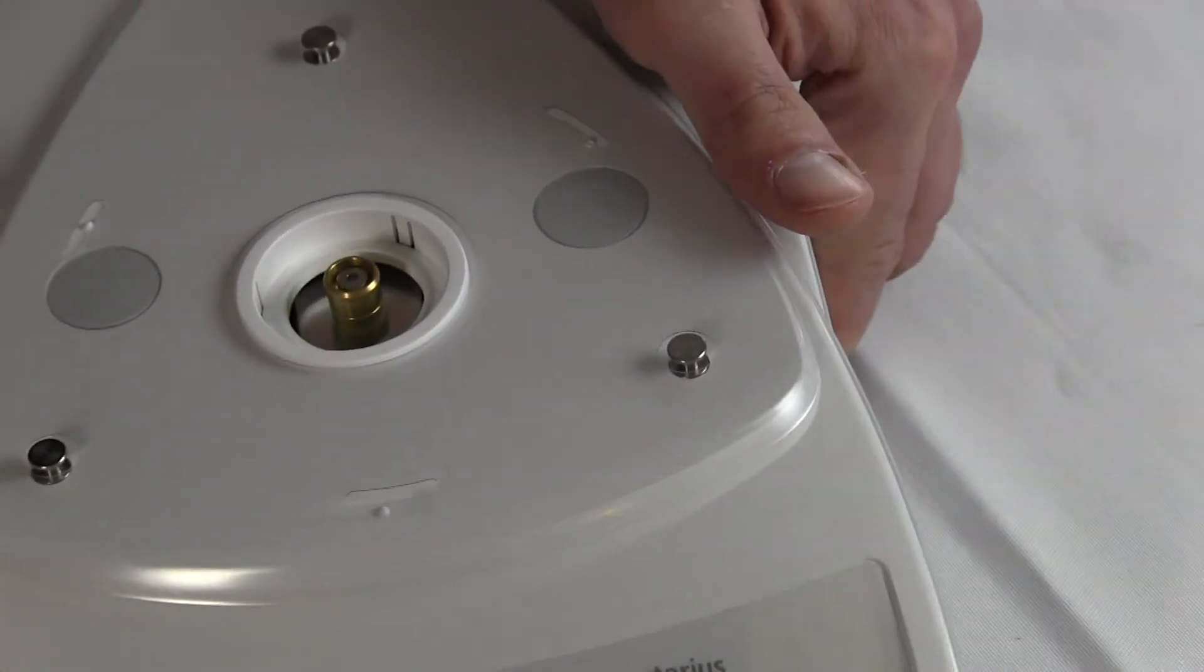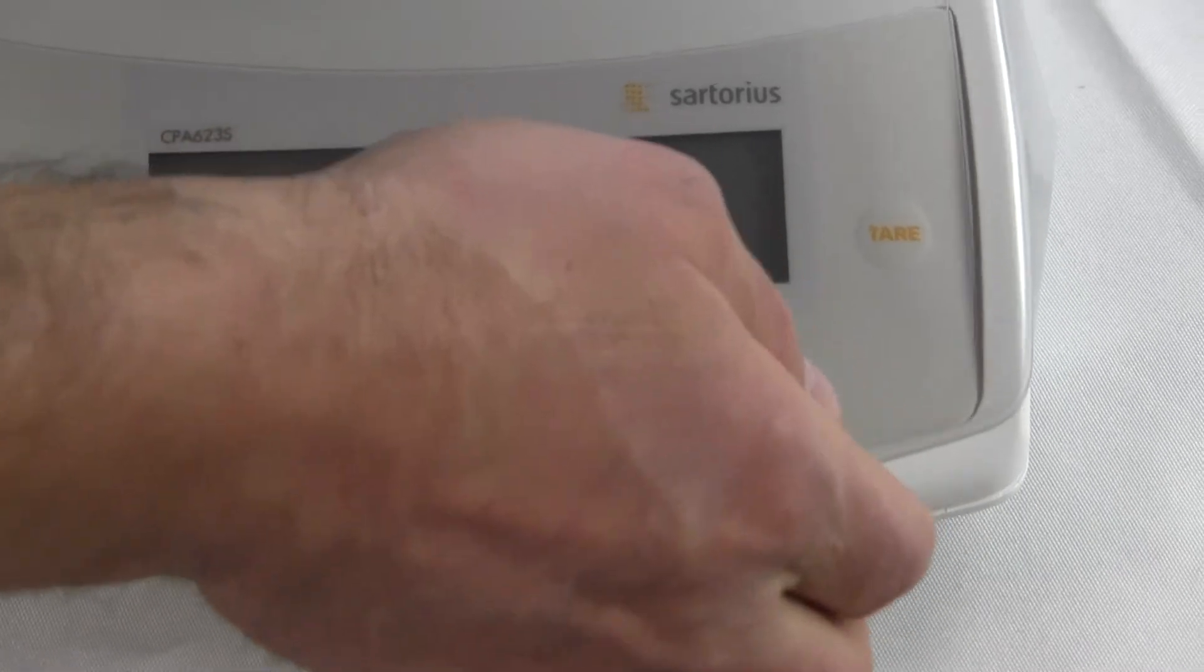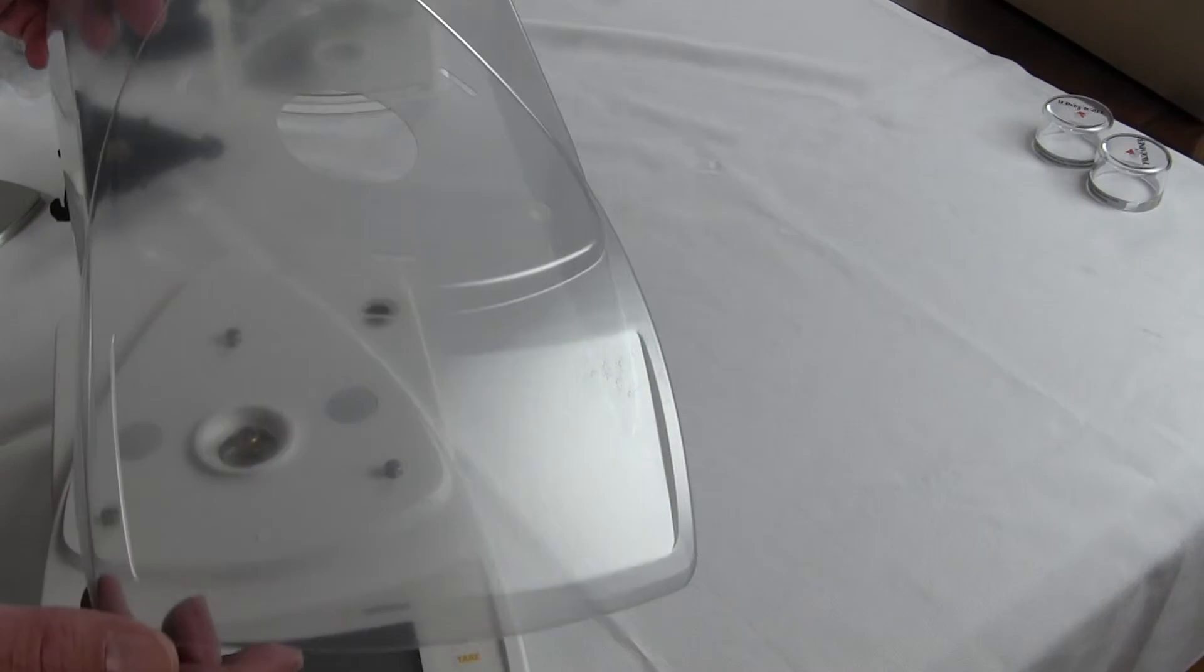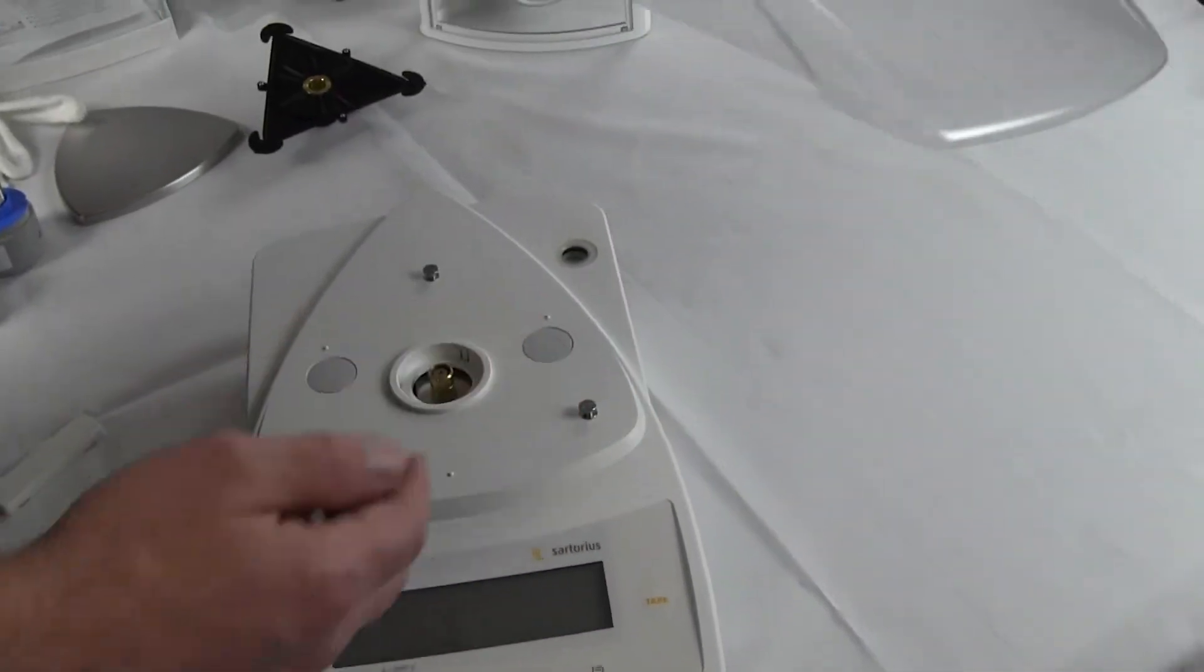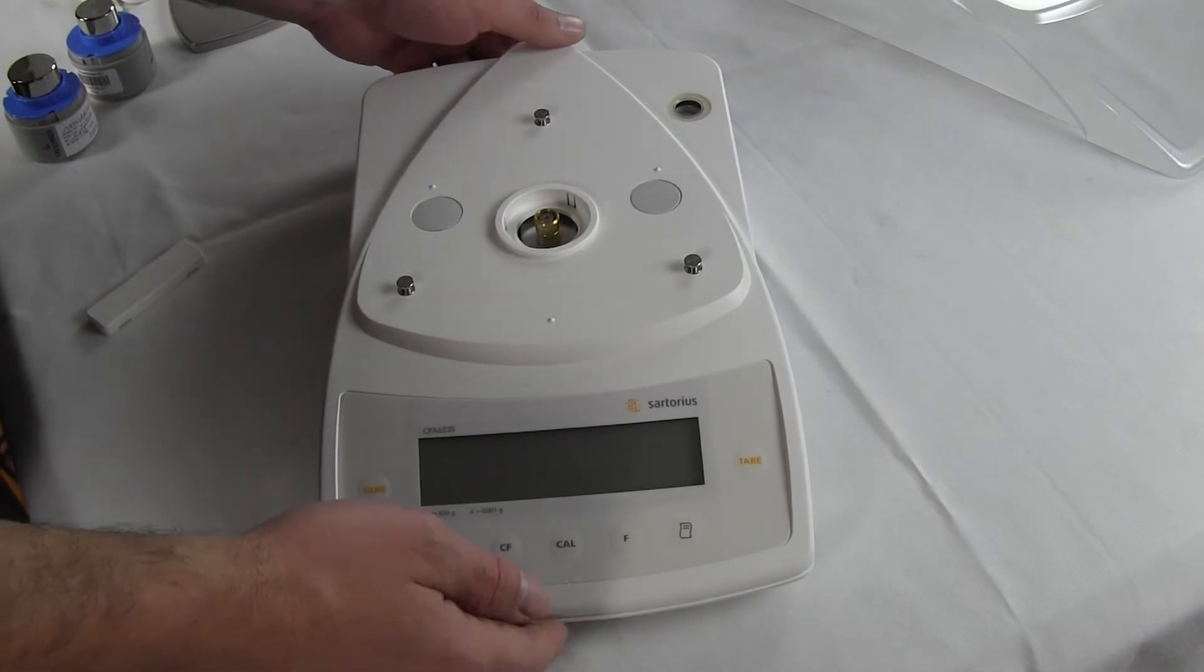The balance comes standard with one of these splash guards. You can buy additional units. They're accessories, but it comes standard when you buy a balance on the CPA, you'll get one of those splash guards.